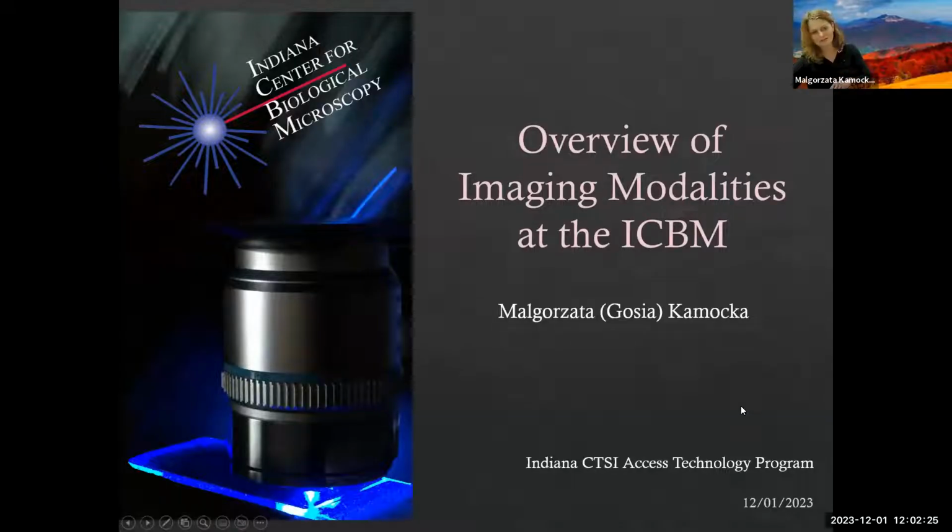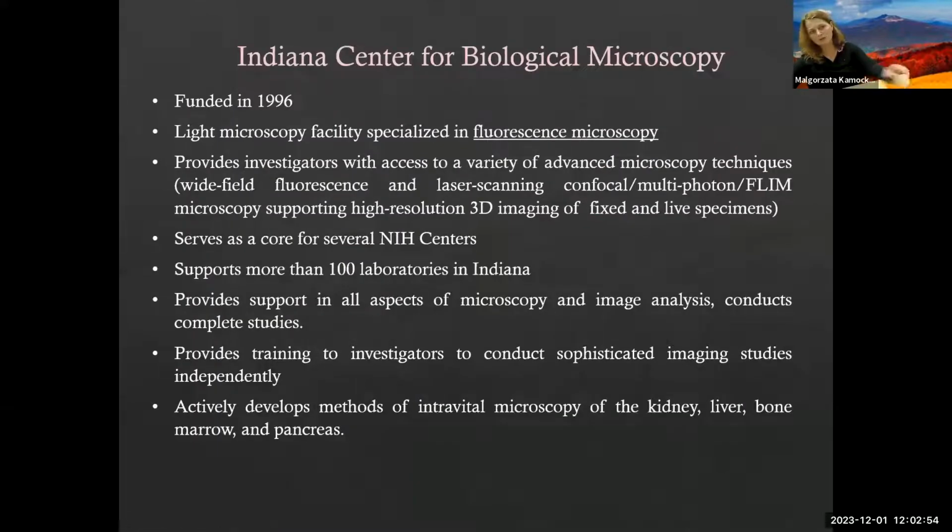My name is Małgorzata, or Gosia, Kamocka, and I represent the Indiana Center for Biological Microscopy. Today I would like to provide an overview of imaging modalities available at our center. I will give lots of examples so you have a better orientation of what can be done using our microscopy systems. We are a light microscopy facility specialized in fluorescence microscopy.